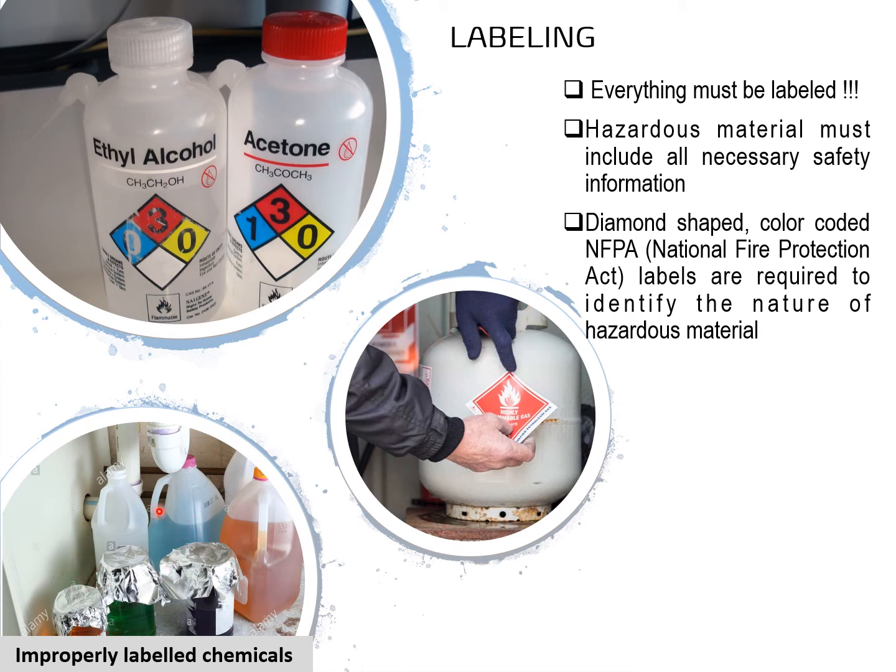So unlabeled containers inside the laboratory, it's a no-no. You really have to place a label and also indicate the NFPA hazard symbol in your container. That's why labeling is very important because it gives you an idea of how to handle the chemical in the container.